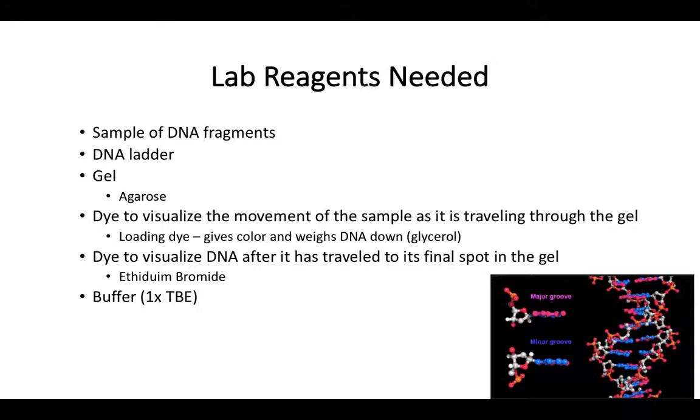So the hurdles are basically like the sieve, and the bigger the components, or the bigger the sample, the slower it would run through the gel, because the hurdles would keep it back. But the more agile, the smaller the sample, the smaller the hurdler, the faster it would run through the gel, right? Because it will be able to get over the hurdles faster.